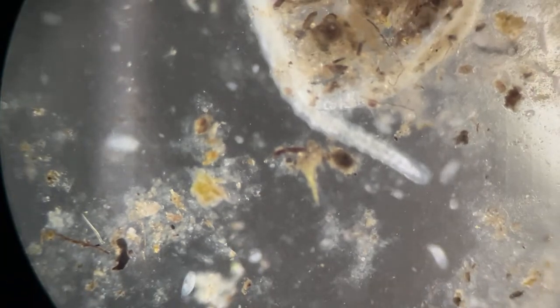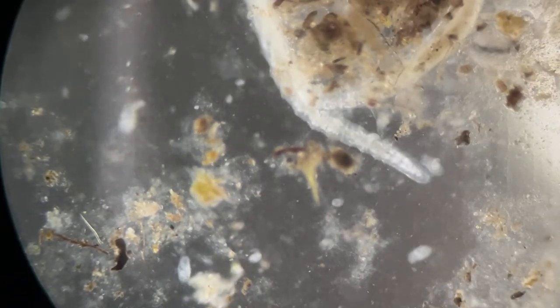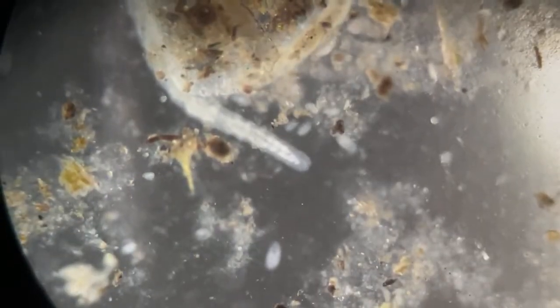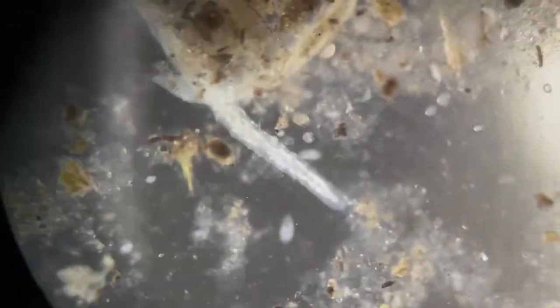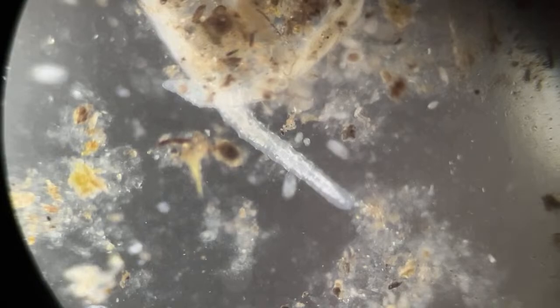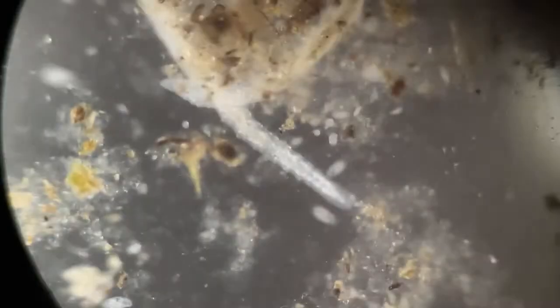So what we see here, another worm. Let's focus. Okay, we'll increase the magnification to 10x objective.